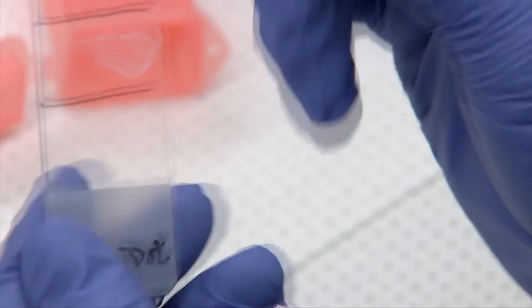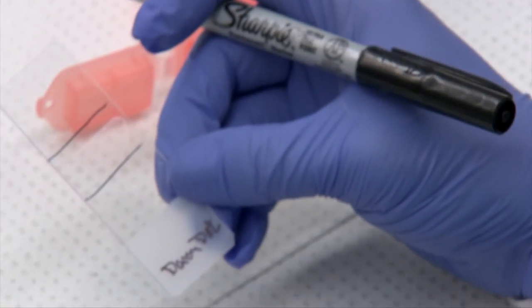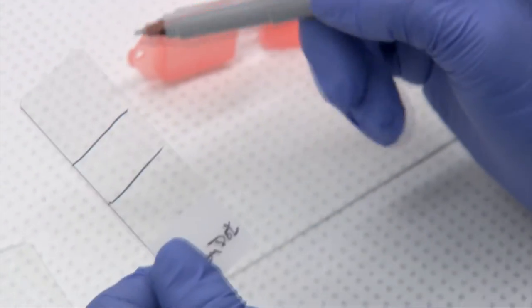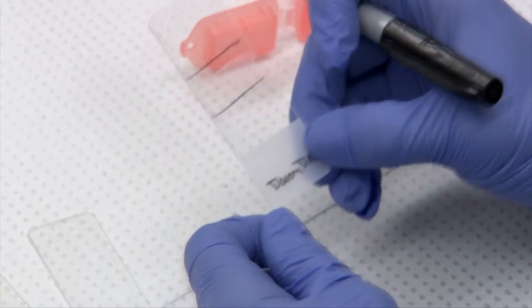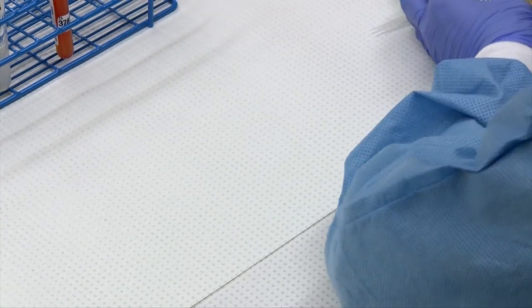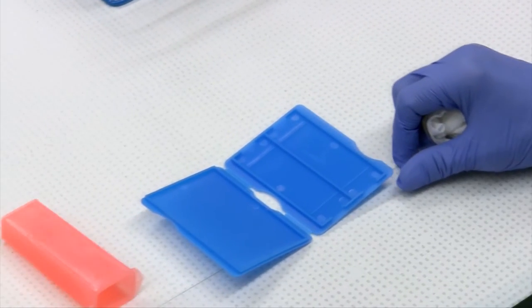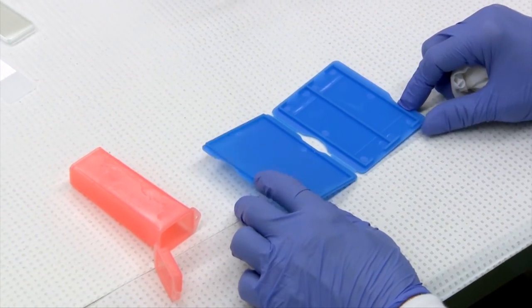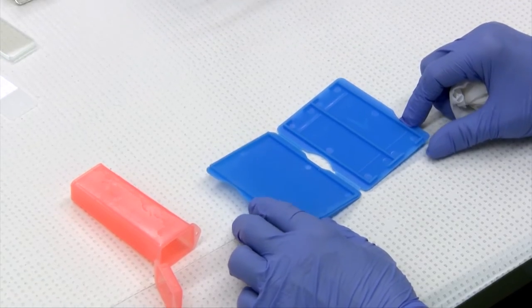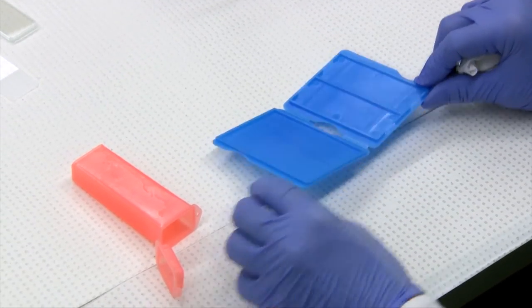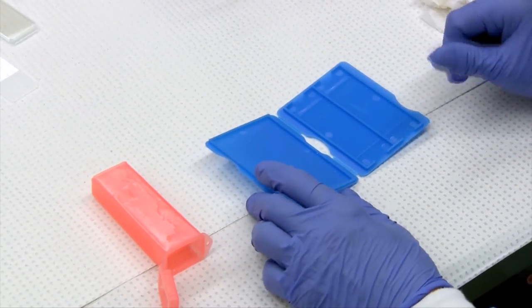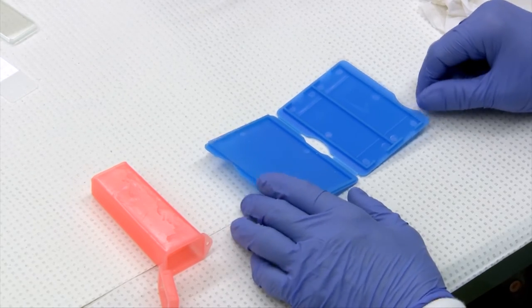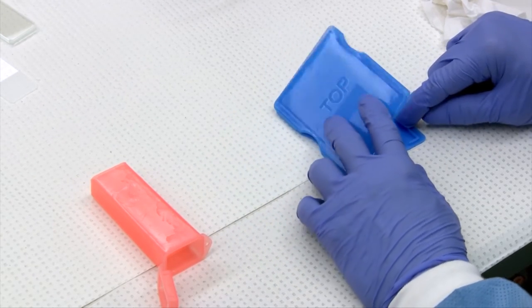It's really handy if you just indicate on the back with either a marker or a grease pencil where your line is because sometimes in non-cellular fluids it's quite an effort to find that line. If you're sending your slides to a reference lab it's important that they be protected from environmental things like flies, water, dirt, and trauma.